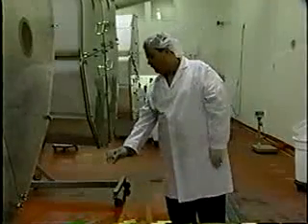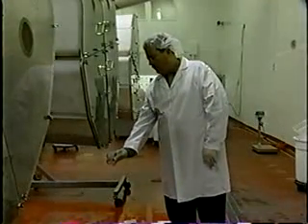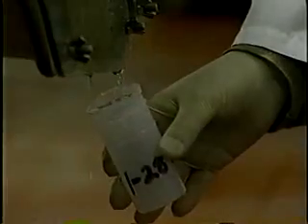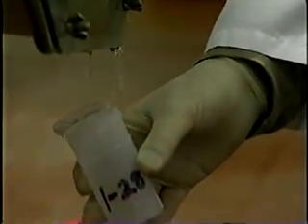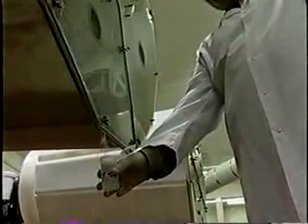Sample collection should be done by personnel that have been trained to collect representative samples aseptically. A representative sample is one that accurately represents the whole lot. If sprouts are grown in drums or in trays with a common water outlet, a single 1-liter sample should be collected as water leaves the growing unit.